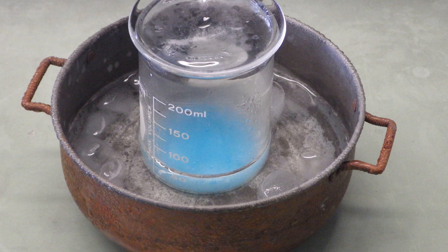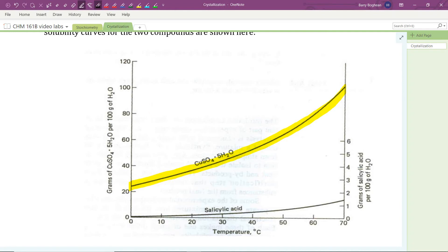We have no reason to be concerned that we will lose copper sulfate from solution during this cooling in the ice bath. If you recall, we weighed out approximately 2.5 grams of our mixture.